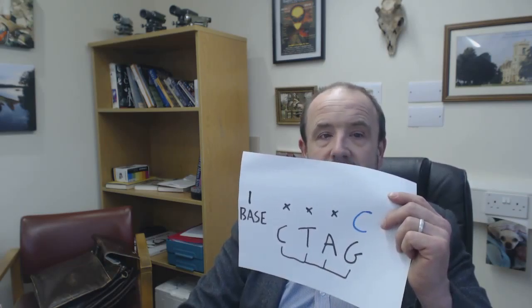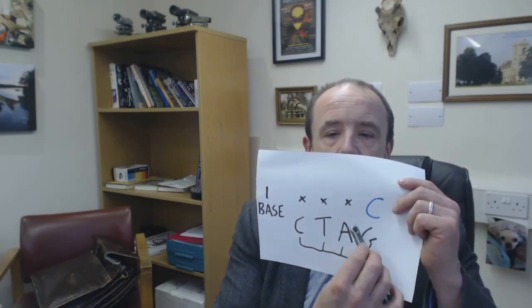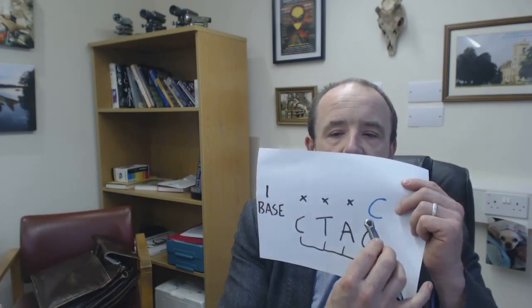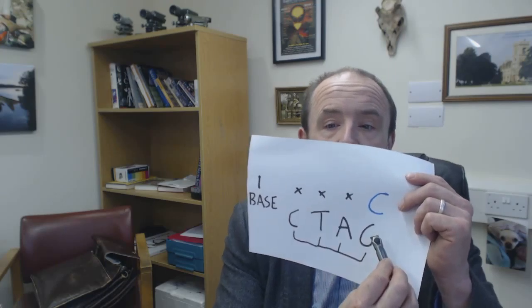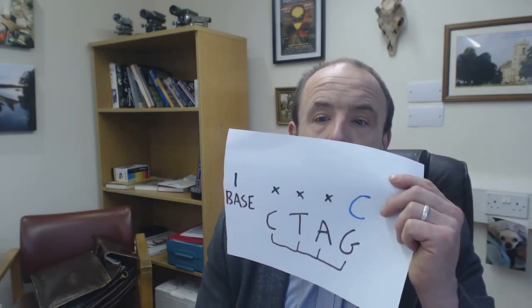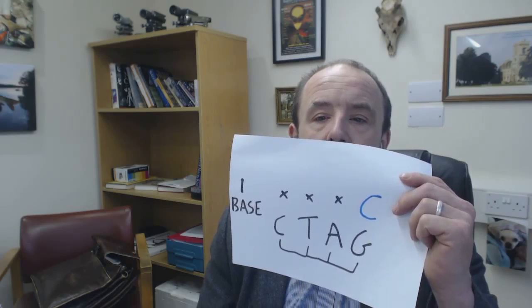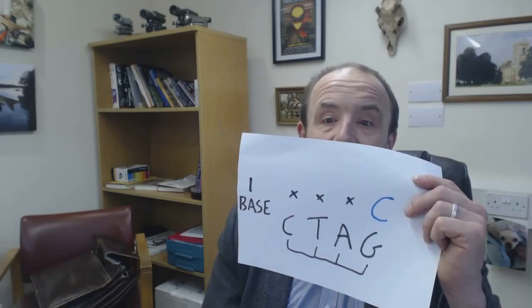We then bring it down to the primer annealing temperature, and let's say in this particular permutation a C comes down and joins with this G. Because it's a dideoxynucleotide, a blue C, all subsequent binding on the molecule is inhibited. This means we're left with a fragment of one base pair in length.